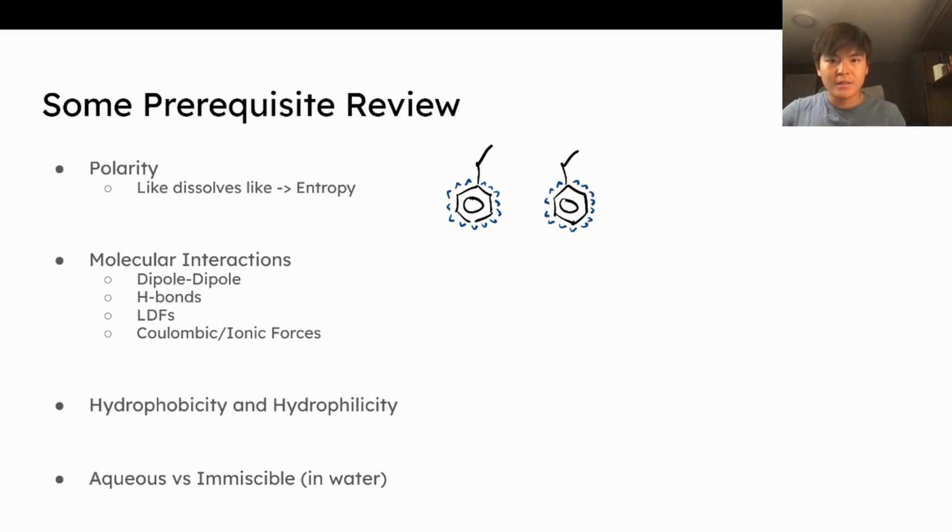But okay, so now we have two hydrophobic or aromatic rings that each have a bunch of water around them. But this is a very ordered position. There's not a lot of microstates that this can exist in. There's kind of just this. But imagine the contrary. Imagine if these two rings are on top of each other. Okay, imagine that's a ring down there.